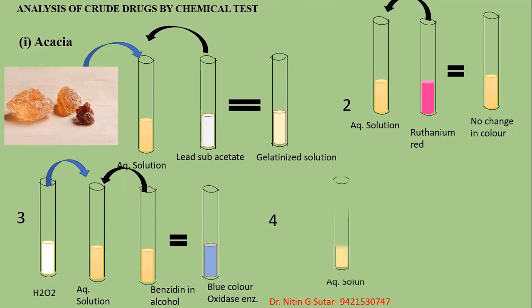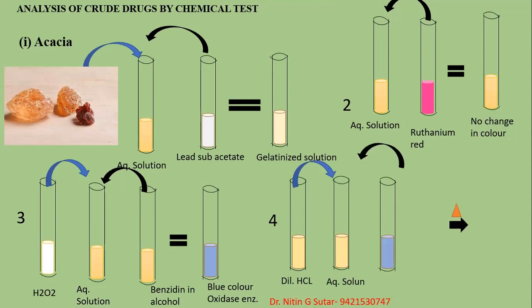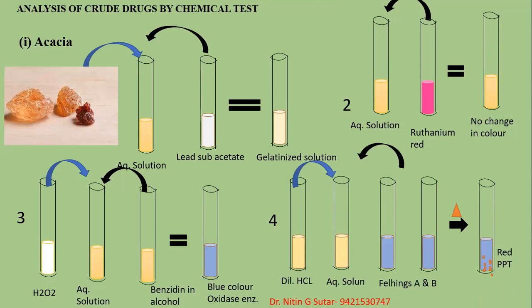The fourth test: take the aqueous solution of acacia, add dilute hydrochloric acid solution, and then add Fehling's solution A and B. Heat that particular mixture. After heating, you get a red color precipitate. That indicates that acacia is present.